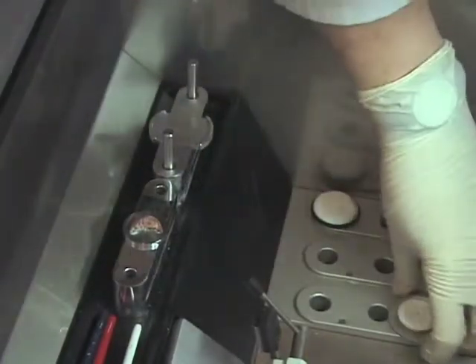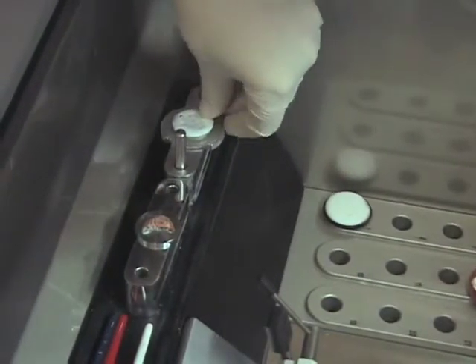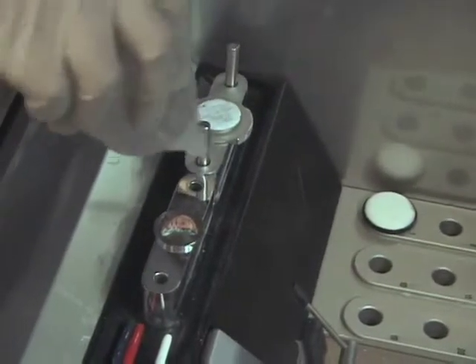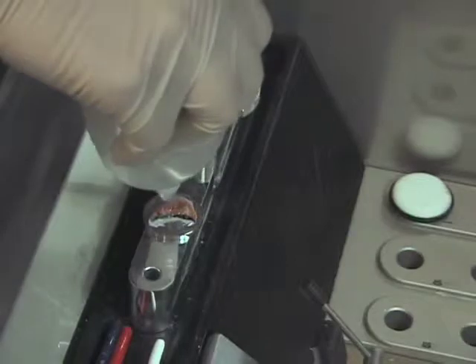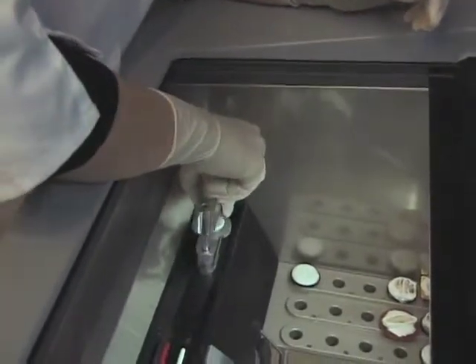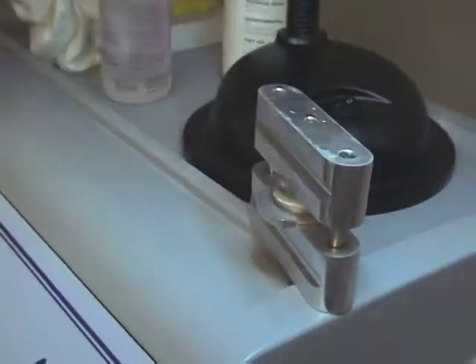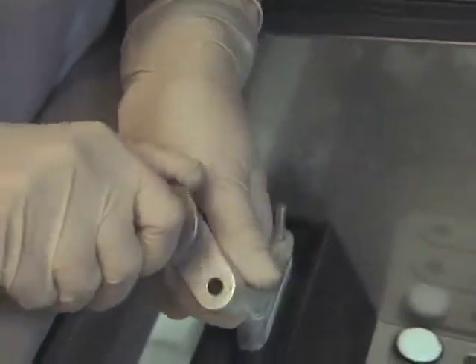This adapter is used for the regular and large size Thermal Shandon chucks. A technician's least favorite part of tissue processing is adjusting and readjusting the chuck holder so the specimen is parallel to the blade. When using the cryo embedder to freeze and orient specimens, each specimen is lowered onto the posts at the same angle, so very little, if any, adjustment will be needed when cutting. Perfect — yet simple and easy.